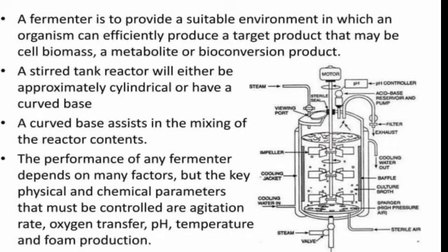The temperature is also very important, and foam production too. Too much foam production would reduce the oxygen reaching the cells. So this is a bioreactor that I would have.